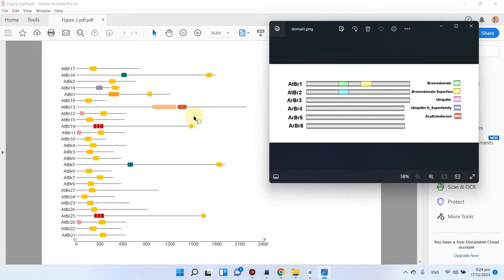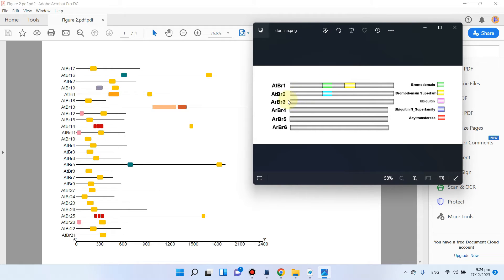Welcome to another tutorial of a video series on genome-wide analysis. In this video we will be creating our second figure, which is domain architecture analysis. At the end we will be able to create figures using TB tool, and we will also be using DOG software to create a more beautiful figure using manual domain architecture analysis.